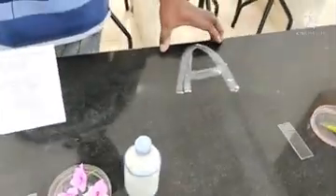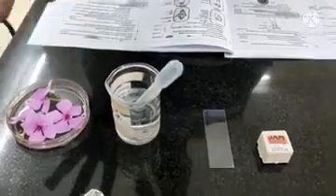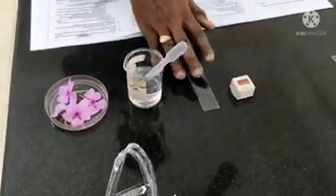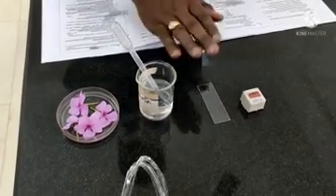The first question is A. Under this A we have 4 choices, 4 options. A1 is the slide preparation for the experiment on pollen grain germination percentage calculation. For this we require the flower Vinca rosea and sucrose solution. These requirements will be kept in the rack, as explained just now, at the A1 place. Then, by taking these requirements, you have to prepare the slide using the cover slip and everything. Keep in mind, you have to use only the sucrose solution to prepare the slide.